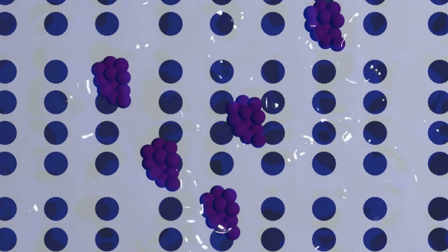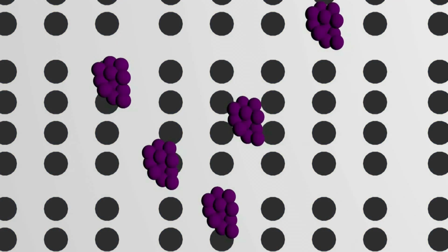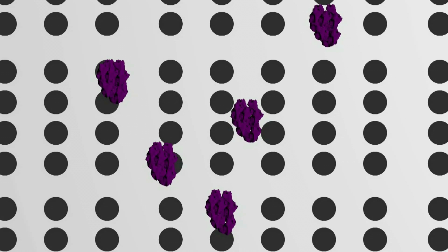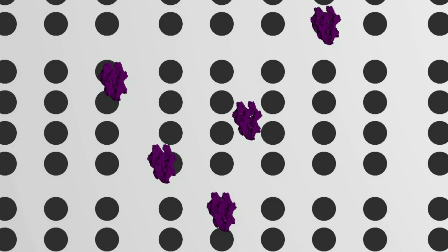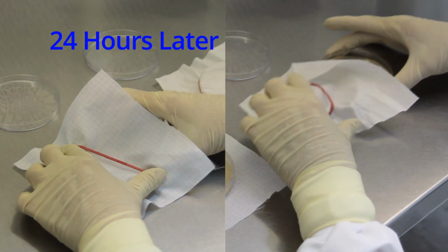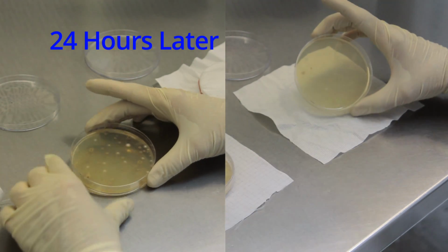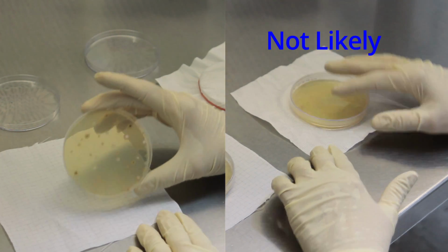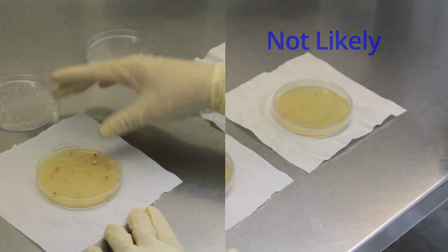The third problem with this test method is that there is no vacuum or pressure applied to the fabric to help the bacteria pass through it. Even the small amount of liquid applied by spraying will be of no help after it has quickly evaporated. With no mechanical help, the bacteria will not pass through the fabric and the BFE will be higher. The final problem with the test method is that the petri dishes are not incubated. This would make it very unlikely that colonies would grow sufficiently in 24 hours, as shown in the reenactment.